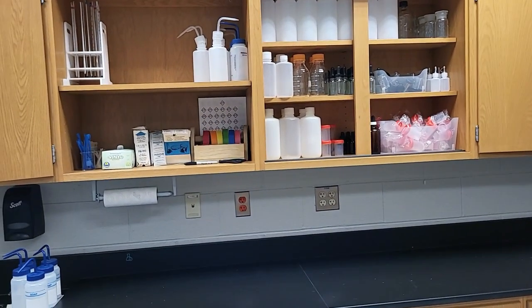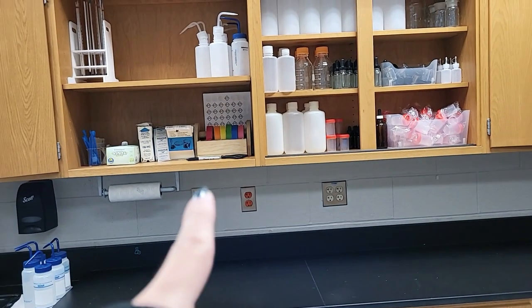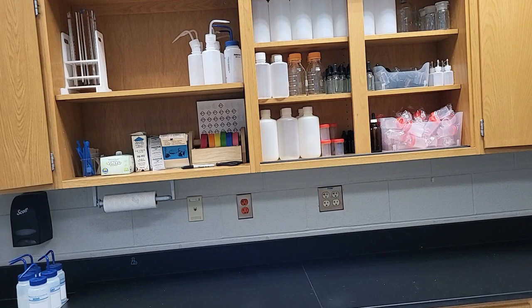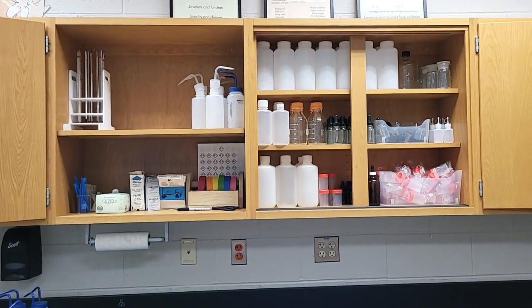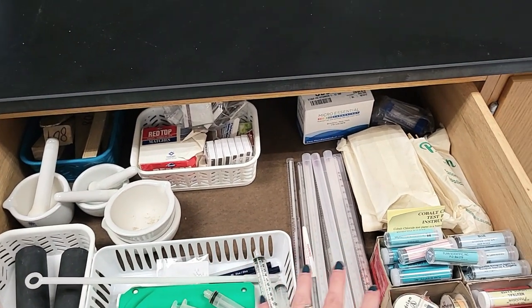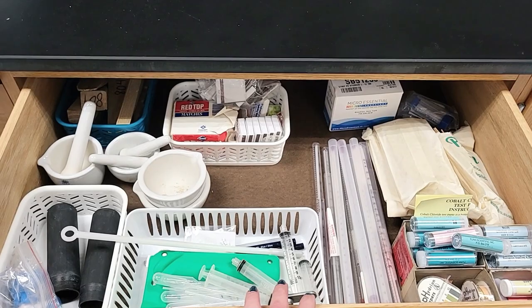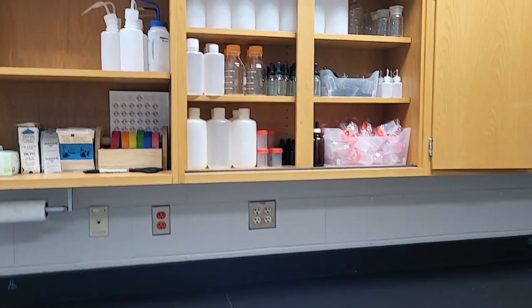So to make my solutions, do any dilutions, maybe take some time to put anything in those little specimen cups, right? All my solid chemicals. So I designated this side of the room to have all my reagent bottles. I also have different pieces of equipment here that I would possibly need for students, like pH paper and some of the smaller stuff. But this is really, like I said, a place for me to make anything that I need to make for a lab.